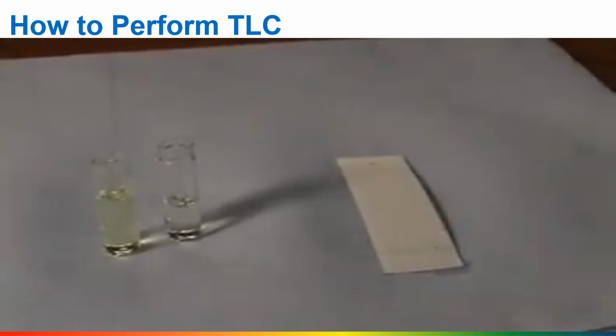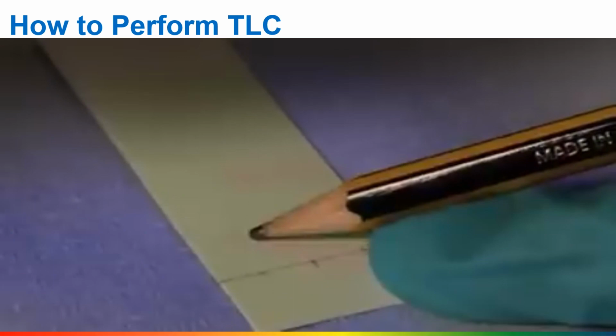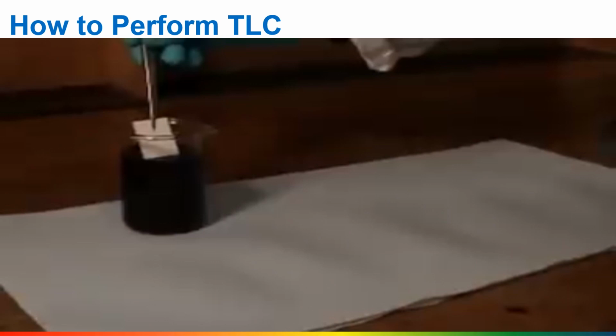There are a few ways to visualise TLC plates. If the compounds are UV active, you can see spots of the compound under a UV lamp. Use a pencil to circle the spots. A range of chemical dips can be used, which react with certain functional groups producing a colour change, for example potassium permanganate.